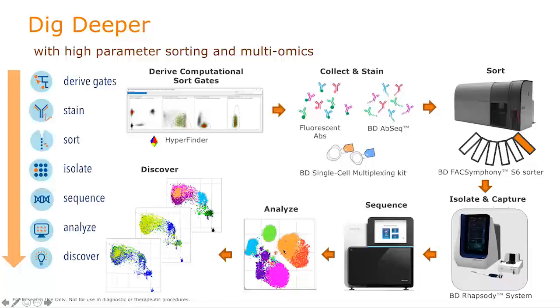And our expression matrices, at least through this pipeline, are all locked down. It's not that the matrix is locked down; the pipeline to get the bioinformatics to get the sequencing out into a usable expression matrix, we have locked down and sorted out for you. And we have a service that we provide. So it's just point and click.